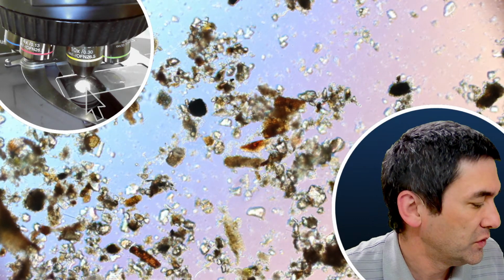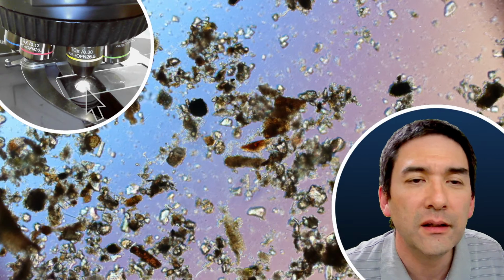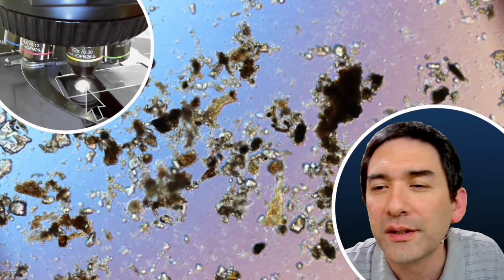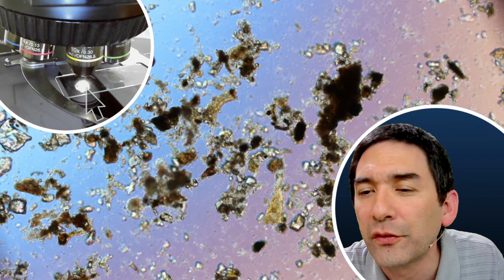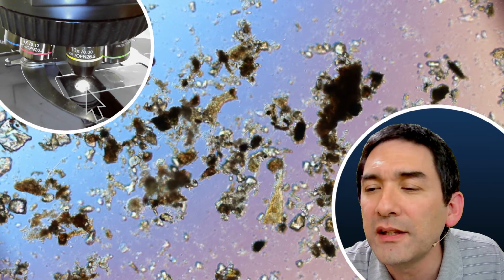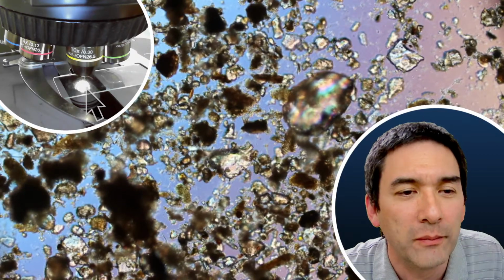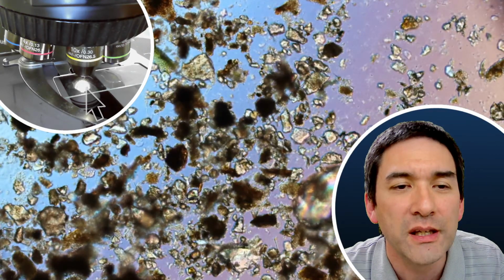And I'm going to tune down a little bit the light intensity again, and we can continue to scan. As I'm scanning the slide, I'm also trying to keep an eye on some of the comments here. Yeah, so there are rotifers over here. For me, tardigrades are amazing creatures, especially under an electron microscope. They look scary under an electron microscope. If you just Google a little bit, you're able to find lots of these images.